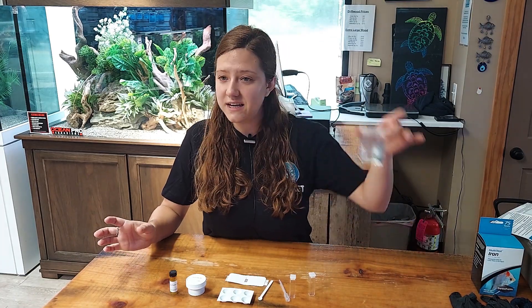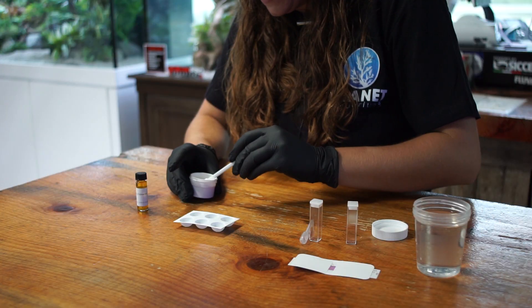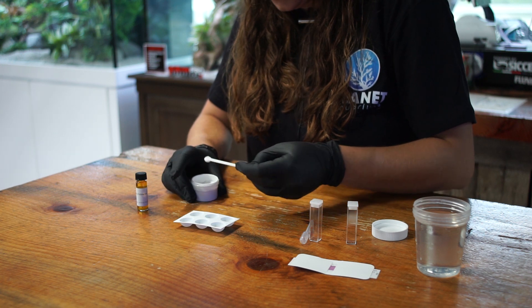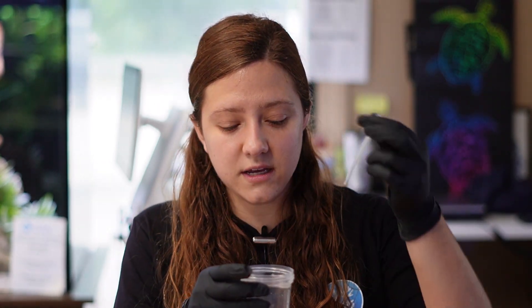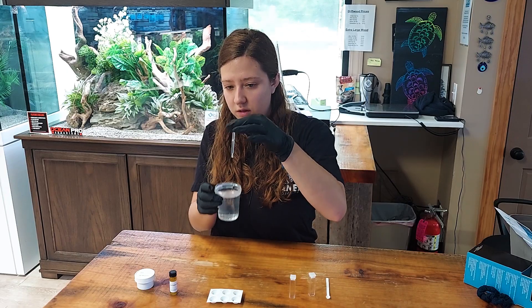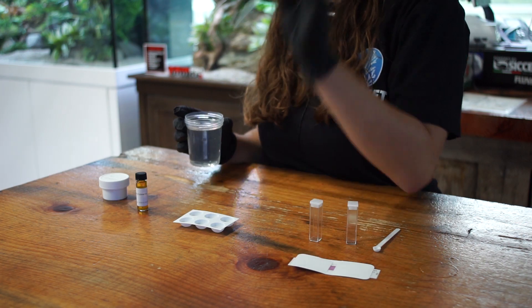Besides that, the only other thing you are going to need is the water that you are going to be testing. The first thing you are going to do is start with iron reagent one, which is going to be your powdered reagent. Take your small scoop and add one level measure of the powder to one of the test wells. Then take your pipette and fill it up to the base of the bulb with the water that you are testing, and put it into the cavity — you are going to do this twice.